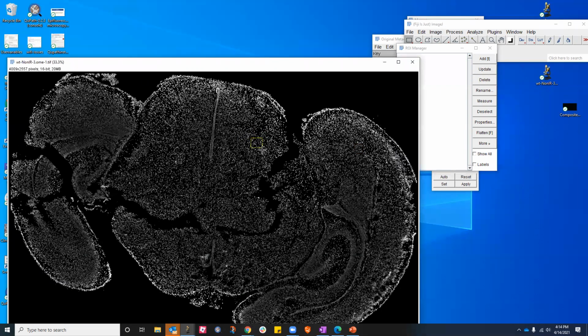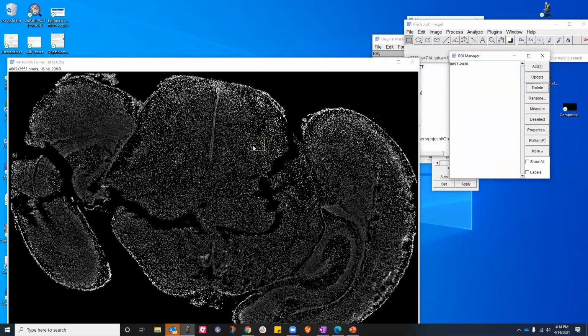So if I just say T, I can, let's say if I, by mistake, it got removed, I can bring this back and go and put the same size ROI somewhere else, same size ROI somewhere else. So every time I go somewhere else, it's the same size ROI that I'm getting. Right. Okay. That's very neat. So this can be very helpful in making sure that your image dimensions remain the same.